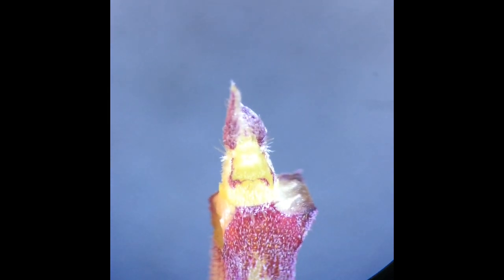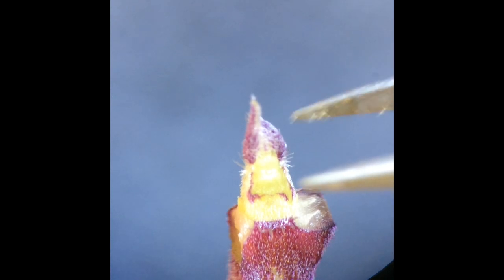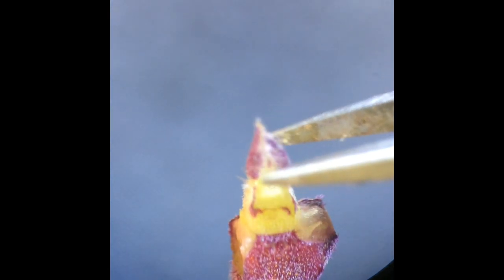Now, because of the plant's opposite and decussate leaf phyllotaxis, I am rotating the shoot by 90 degrees to see the next pair of leaf primordia on either side.